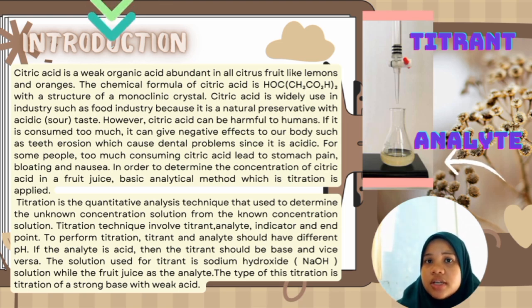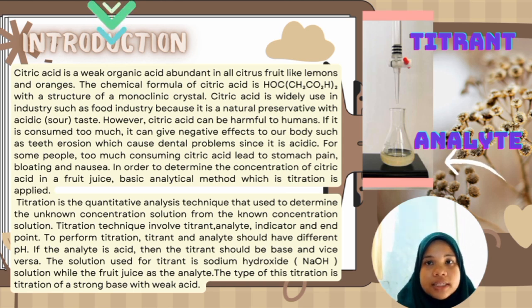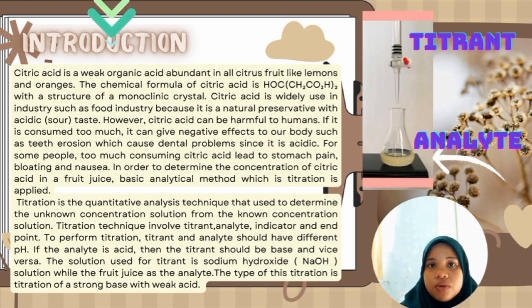However, citric acid can be harmful to us if it is consumed too much and leads to negative effects to our body. Since citric acid is acidic, it can cause teeth erosion, which is a dental problem. Meanwhile, for some people it can lead to stomach pain, bloating, and nausea. Therefore, a basic analytical method, which is titration, is applied.